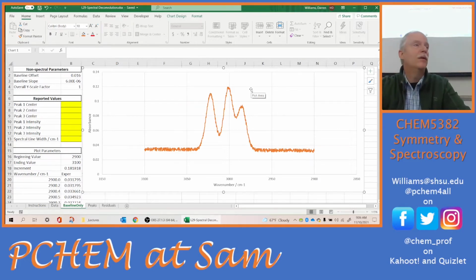And that's a problem. So to get an accurate position of this peak, and this may be really essential for your analysis of peak shifts and so on, you would want to do deconvolution. Convolution is when we take independent Gaussians and we're simulating a spectrum. We have the Gaussian positions, the widths, and the heights, and then we add them up at each wavelength in the spectrum, and that's convolving the stick spectrum with a Gaussian.